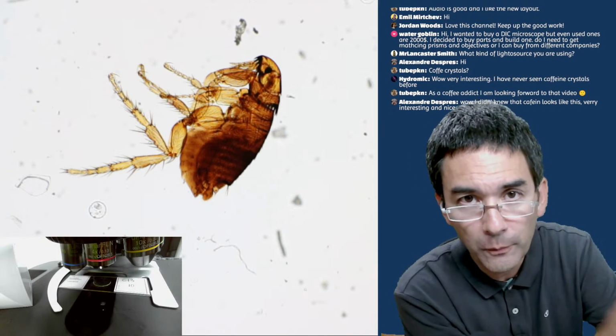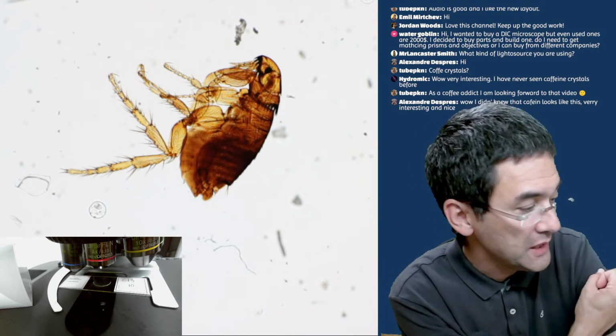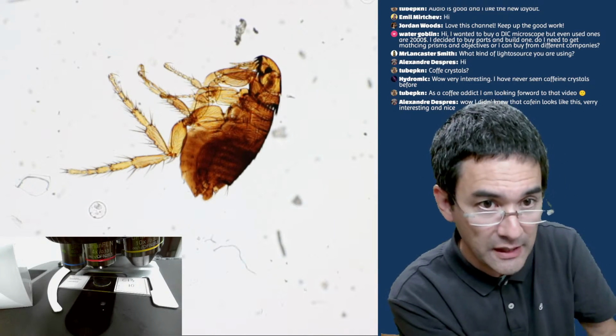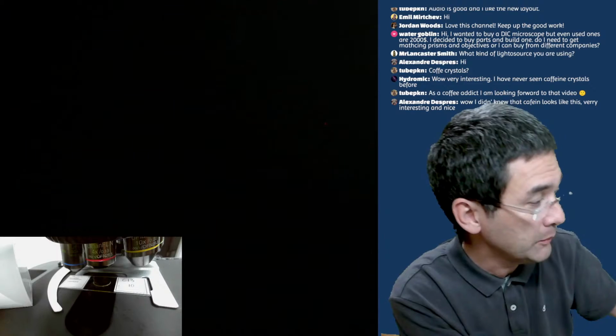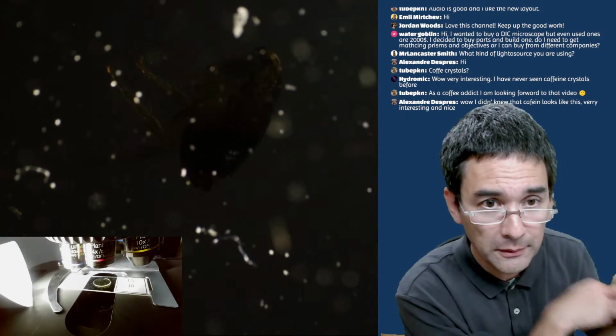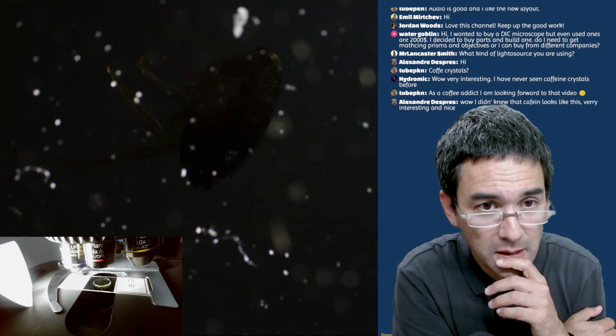And this is a problem when you have light coming from the top, because then you're not able to see it. Just want to show this to you now. See, everything is in focus now, okay? So I don't have to touch it. I'm going to turn off the light, and I'm going to turn the light on from the top, okay? And this is what I see. I don't see anything, yeah?